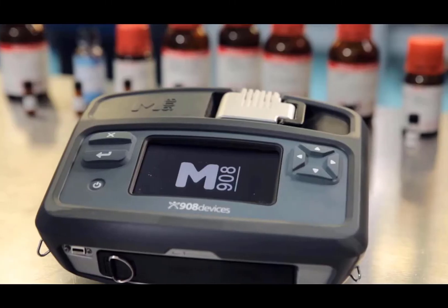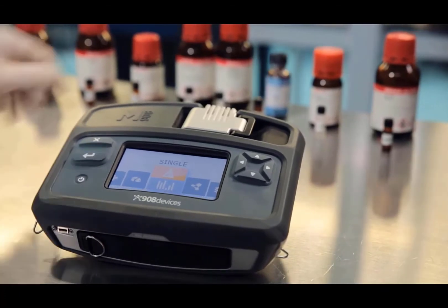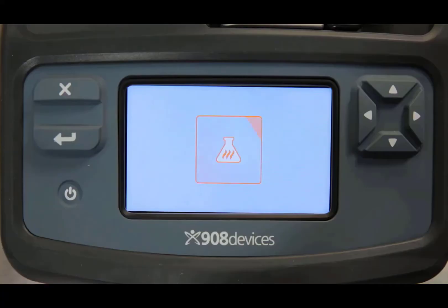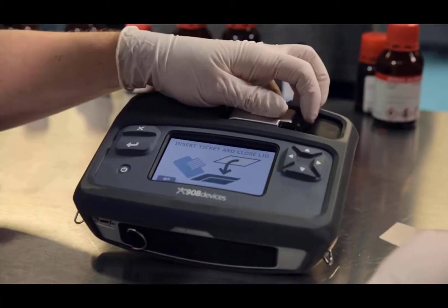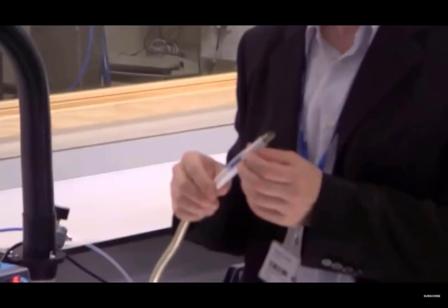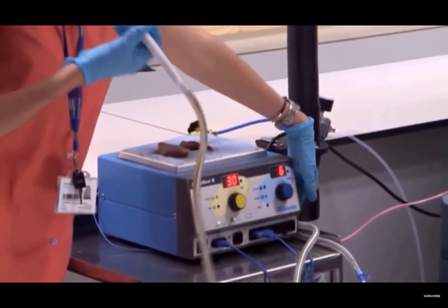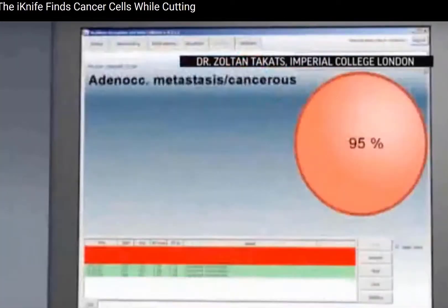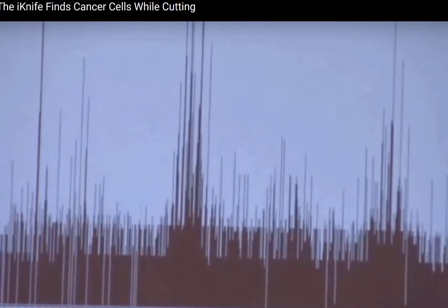Here's a portable mass spectrometer — everything you need to identify unknown compounds in a compact machine. It's basically sniffing a gas; tiny trace amounts of sample and it instantly tells you exactly what it is. If you swab a solid material and put it into the port, the machine heats the sample and identifies it. Another device called the iKnife was designed to assist surgeons. It sniffs the smoke produced during cutting tissue — that's actually just a pork chop shown here — and it can tell the difference between healthy and cancerous tissue, guiding surgeons on what to biopsy.